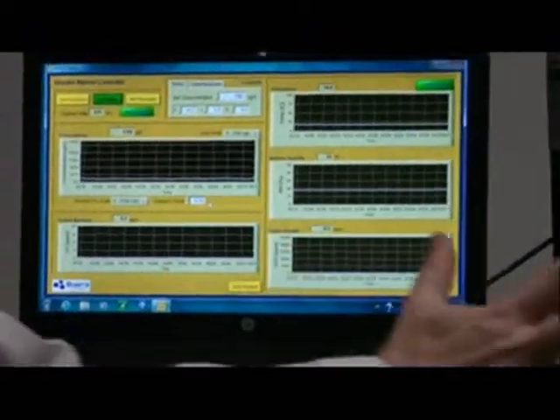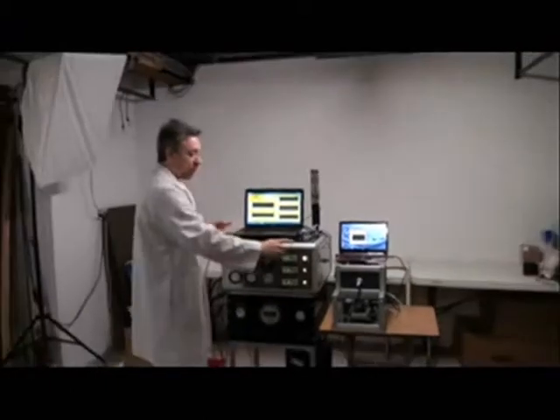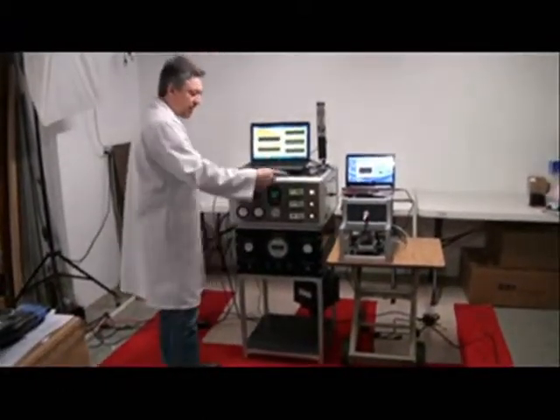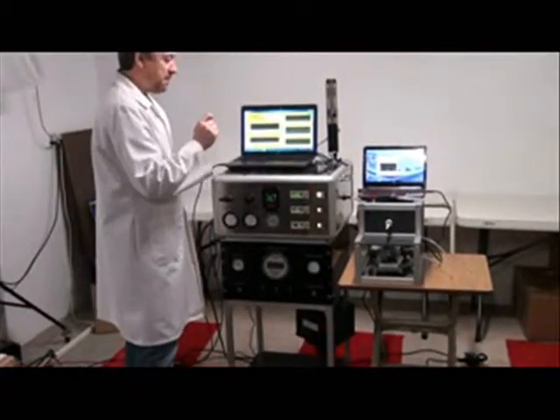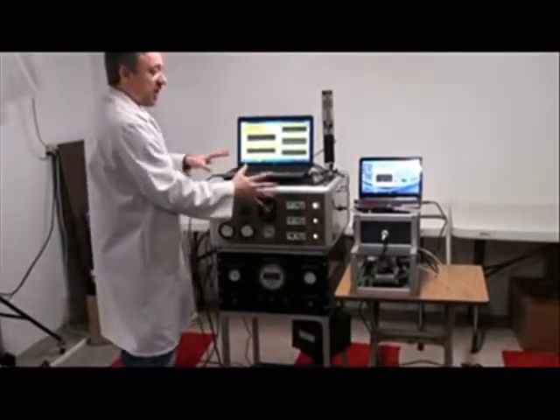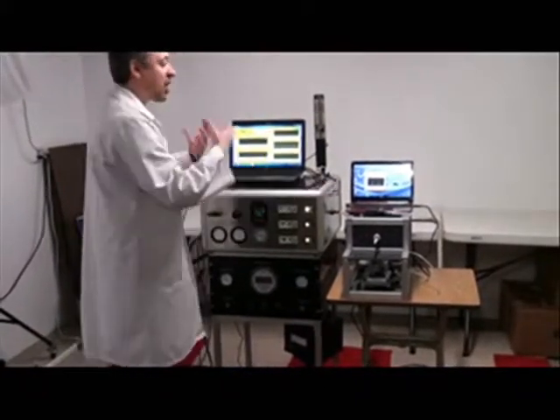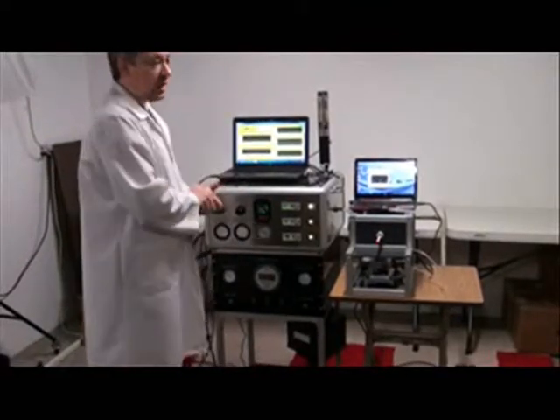As I said, this system works exactly the same way with real cigarettes as well as e-cigarettes, as long as we have a good combination, enough dilution air and enough smoke coming in together to provide the desired concentration in the exposure chamber.